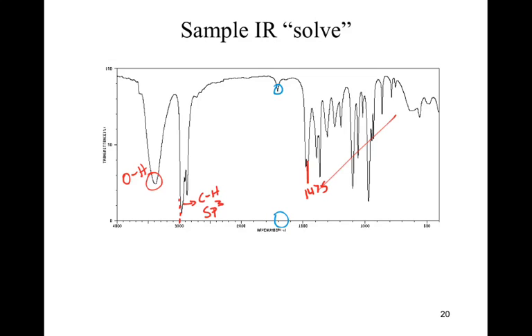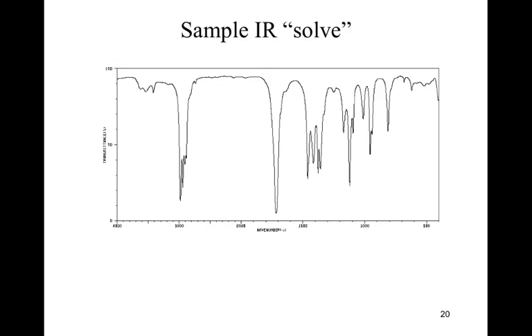And then last one before I go ahead and let you go. Pause. 1, 2, 3. And I will real quickly go through this one. Here's my 3000 line. CH, hopefully at this point you now recognize, sp3. Counted out at 1617. This peak is roughly at 1700. I'm looking at a carbonyl, carbon-oxygen double bond. Rest of that is fingerprint region.